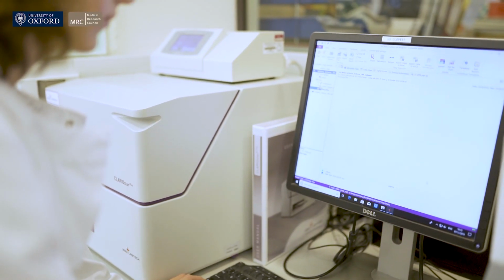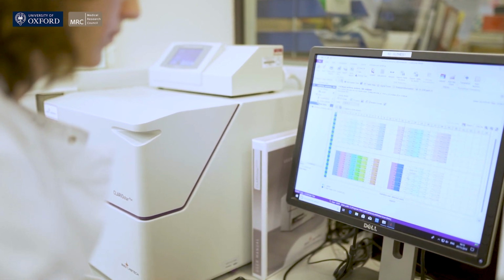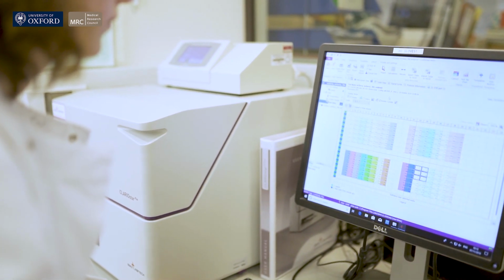Another application is that, because we established all these cell lines expressing our candidate proteins fused to GFP, we can measure in real time how much GFP is produced and select the right times to do our infections.